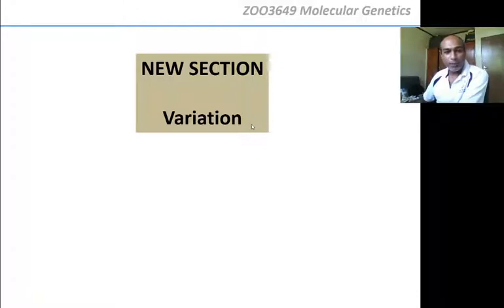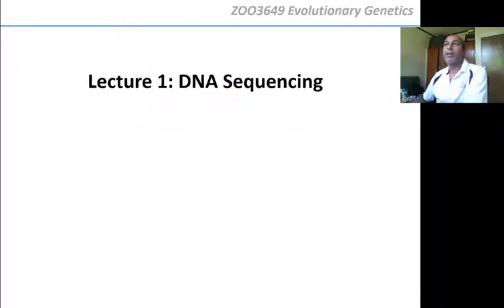I'm Professor Moodley, as you know, and we're going to start this section with the first two lectures basically getting you up to the modern day. Everything we discussed in second year until now has been about how things were done in the old days. All the different DNA markers, all the ways to visualize recombinant DNA. In the modern days, if you ever do postgrad, the only kind of DNA data you're going to be seeing are DNA sequences, okay? And there are two kinds of DNA sequences that we deal with in the modern day. We're still using Sanger DNA sequencing. This is what we're going to be talking about today. But we're also using new technologies called next generation sequencing. And this is what we're going to be talking about in the next couple of lectures.